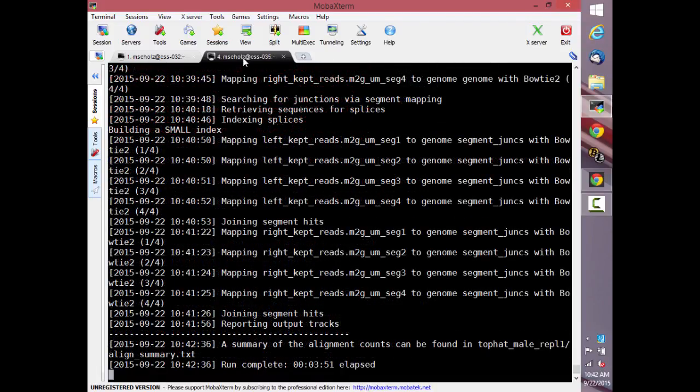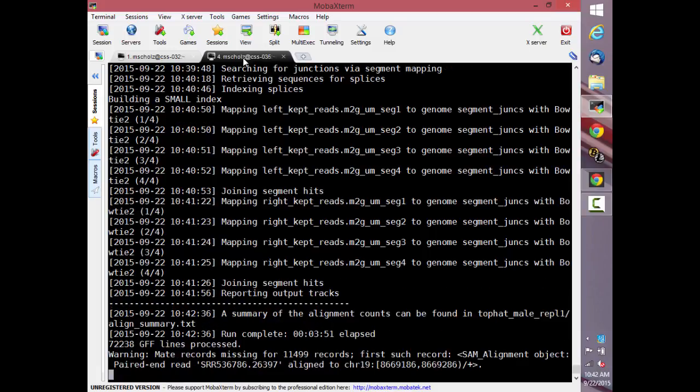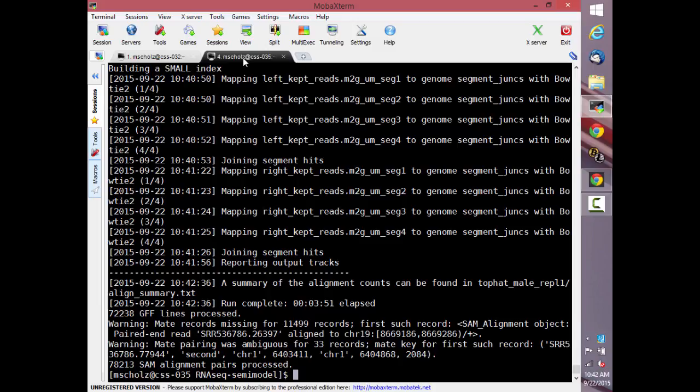So I'm going to talk about the next part while we're running, just you can listen and think and tell me why I'm crazy. So at the end of this, we're going to be able to run EdgeR and get a list of differentially expressed genes. Right? That's at least our hope, because we're going to have 2 conditions, 2 samples each. We'll at least be able to get fake error bars and tell ourselves that there are some interesting genes that might be differentially regulated.